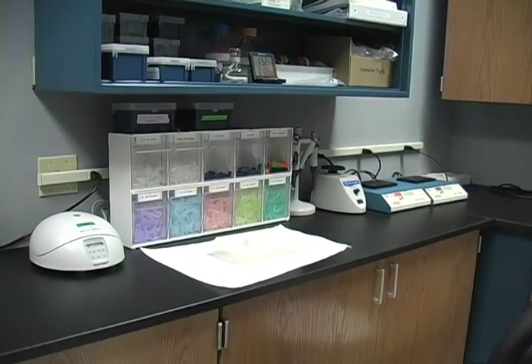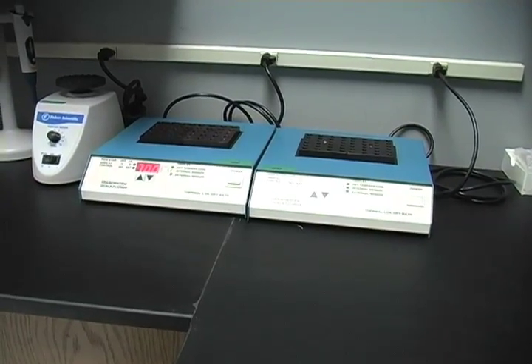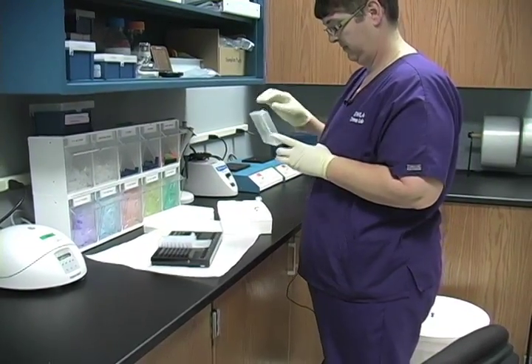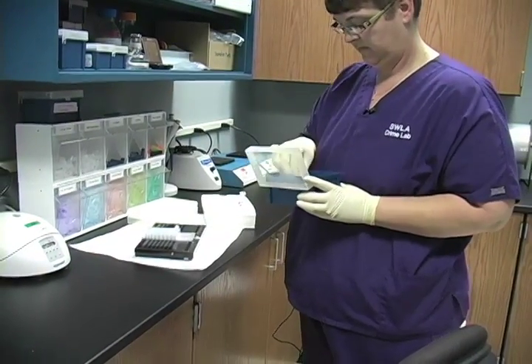This is the DNA extraction and quantification room. It's not just a cut and you get an end result right away, like a lot of times you see on television. When we first get DNA samples, we have biological material on a piece of fabric, on a swab, a cigarette butt, whatever we may have.